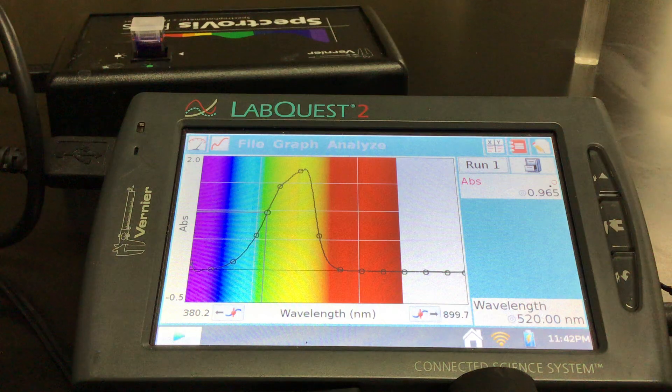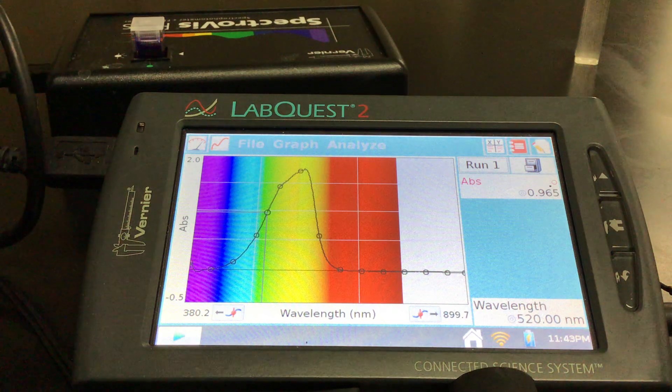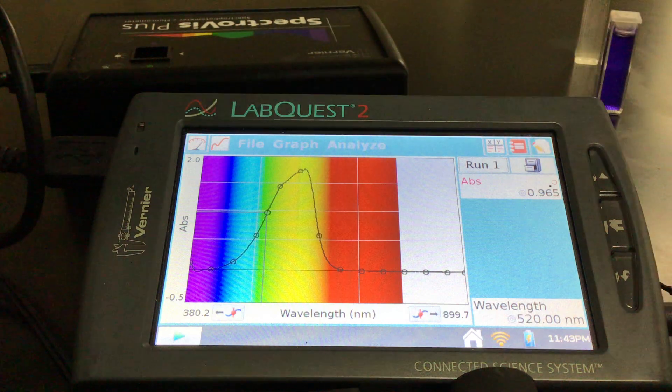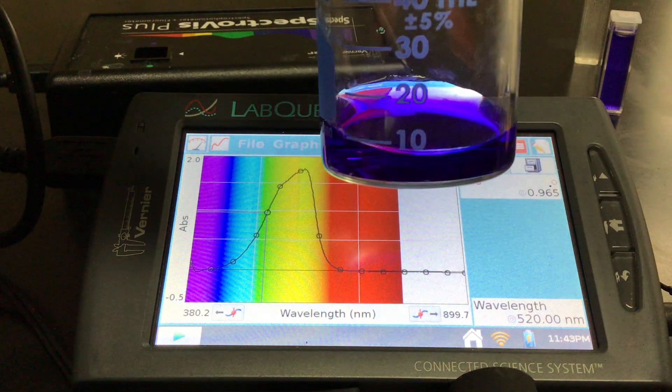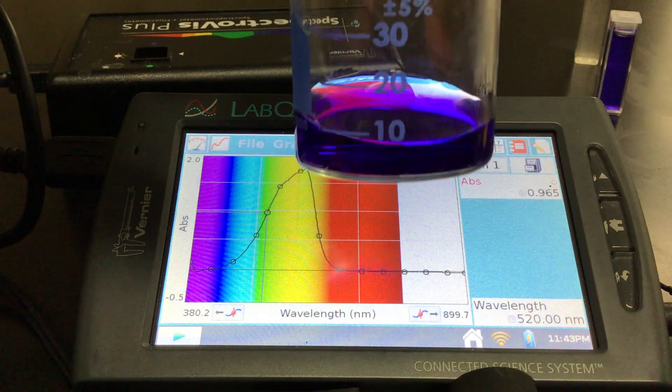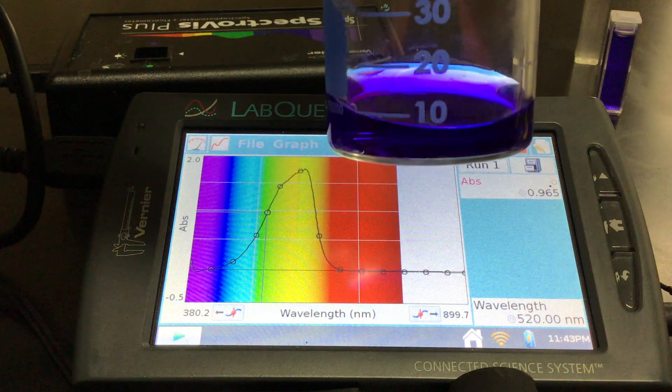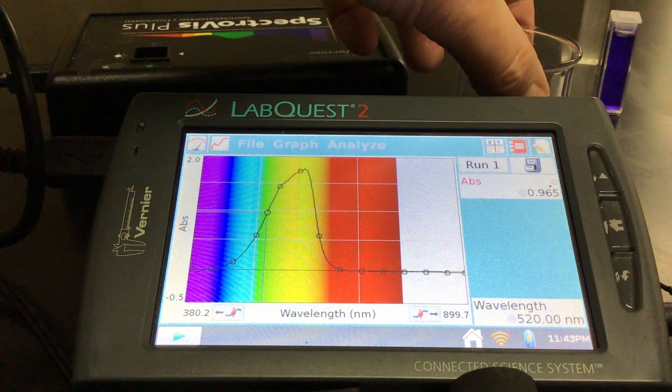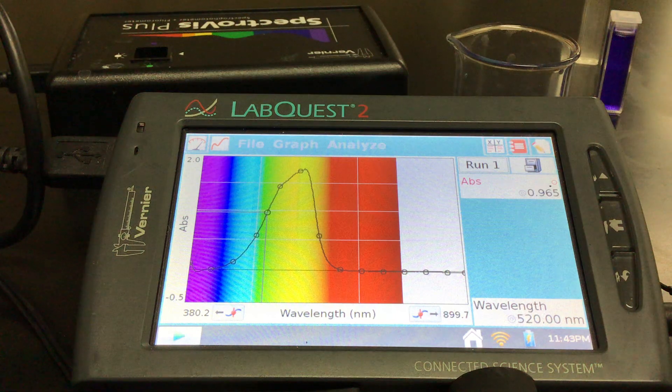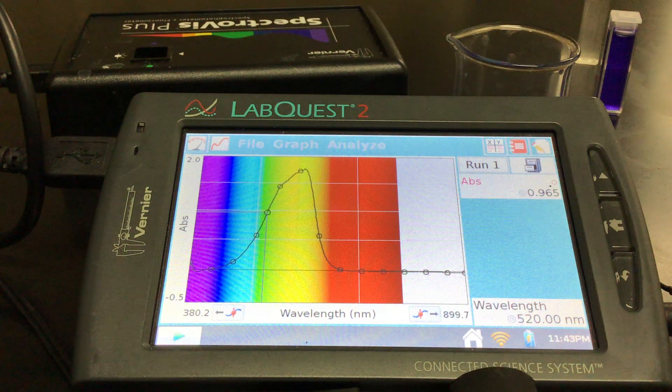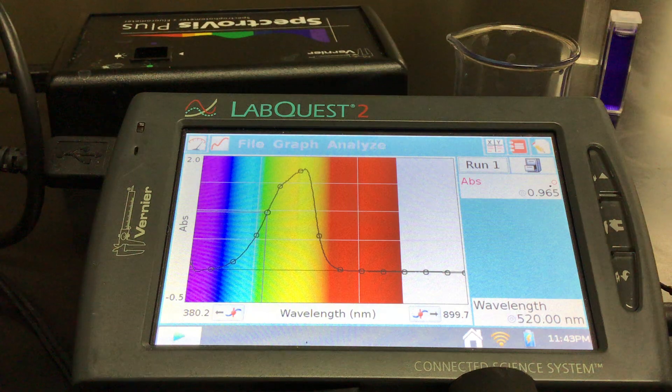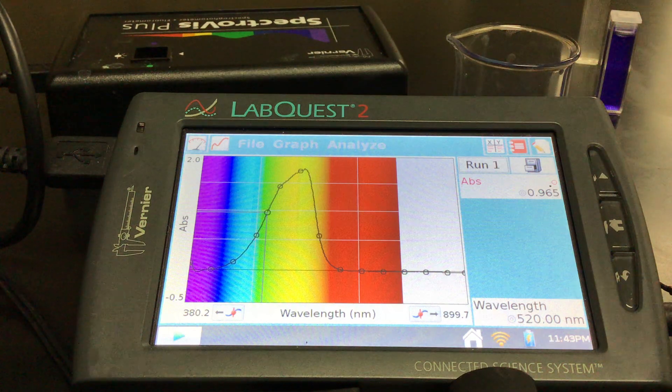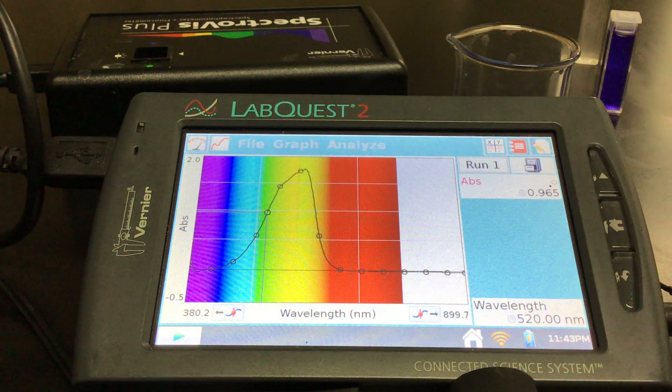I've got some crystal violet in this beaker and I'm going to pour some 0.1 molar sodium hydroxide. This is quite a bit stronger than what's in the lab. The idea with our higher concentration of sodium hydroxide is that it's such a higher concentration compared to our crystal violet that it basically has remained constant. When we look at the change that happens, we can say that's really the order with respect to the crystal violet. The crystal violet concentration is 2.5 times 10 to the negative 5th molar, very similar to what's written in the lab.